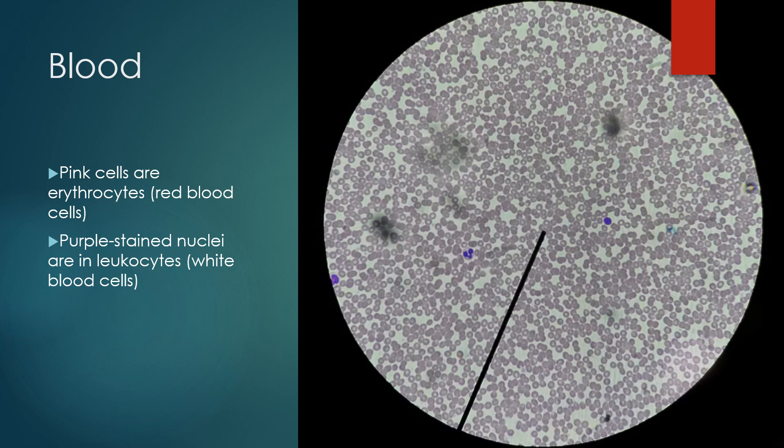Number six, we had blood. The color didn't turn out very true to life in this picture, but the very abundant blood cells you see are the erythrocytes or the red blood cells. They're typically going to appear pinkish red in color and they won't have obvious nuclei. Red blood cells do not have nuclei. The purple stained nuclei that you see in just a few locations are the nuclei of white blood cells or leukocytes.